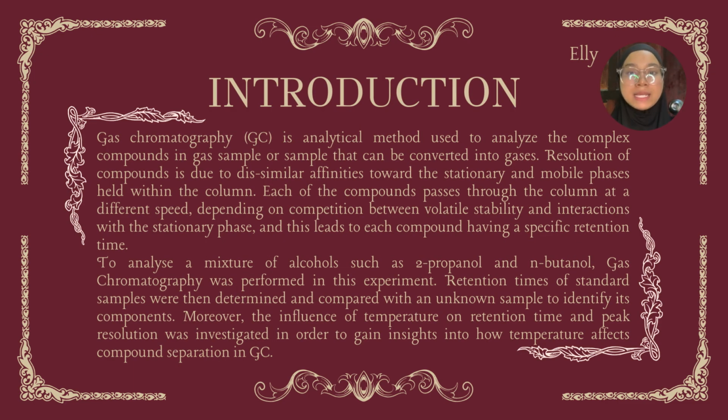Gas chromatography is an analytical method used to analyze the complex compounds in a gas sample, or a sample that can be converted into gases. Resolution of compounds is due to dissimilar affinities toward the stationary and mobile phase held within the column. Each compound passes through the column at a different speed, depending on the competition between volatility and interaction with the stationary phase, and this leads to each compound having a specific retention time.